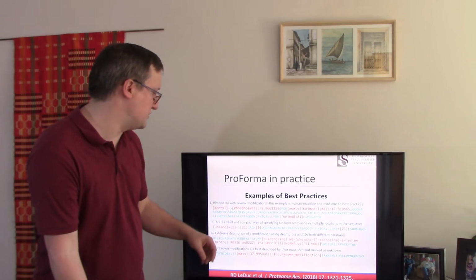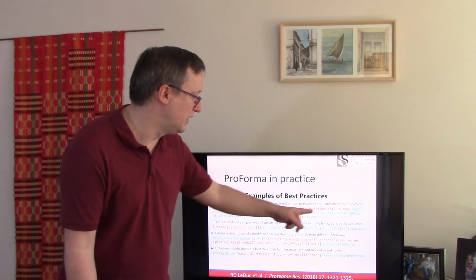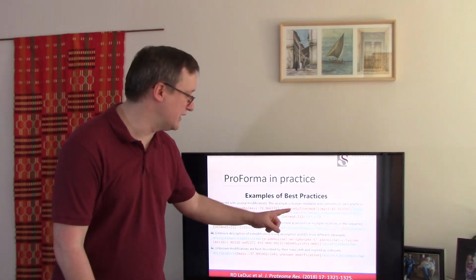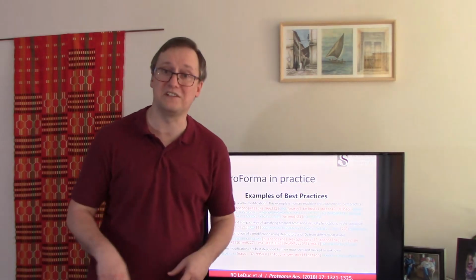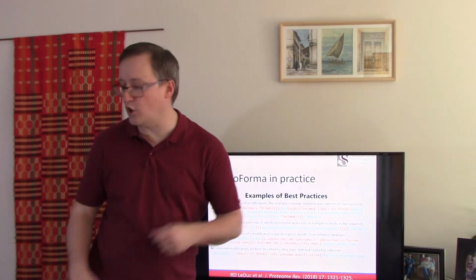So I think that most people working on the bench would know that if they read GRGK square brackets acetyl along with a Unimod code, they can say, there's an acetylation at this point in the sequence, and the letter before it was K. Oh, maybe the acetylation sits on lysine. So that's lovely. This is an example then of how to communicate proteoform information in an open format.